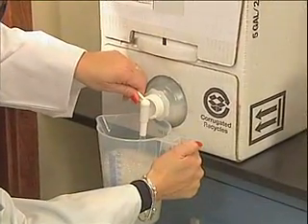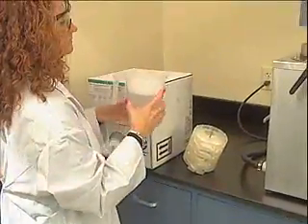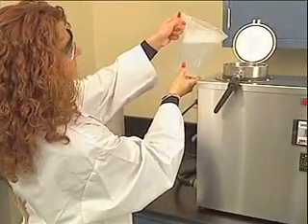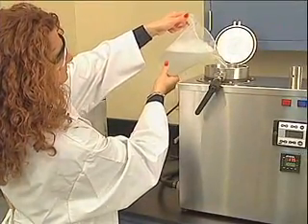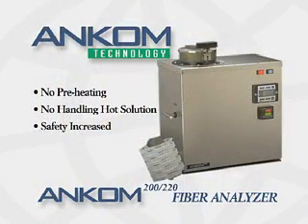1,800 to 2,000 milliliters of prepared solution is added to the fiber analyzer vessel. There is no need to preheat the solution, as the system will take care of that with a push of a button. The user does not have to handle hot solution, so safety is increased.